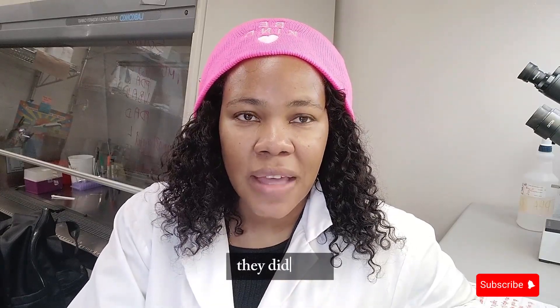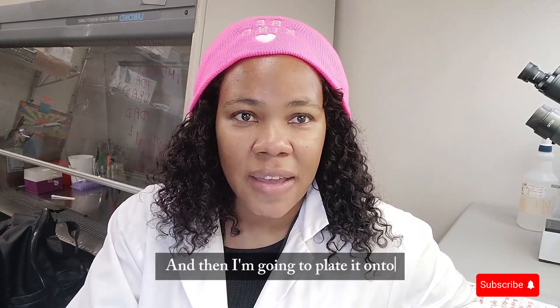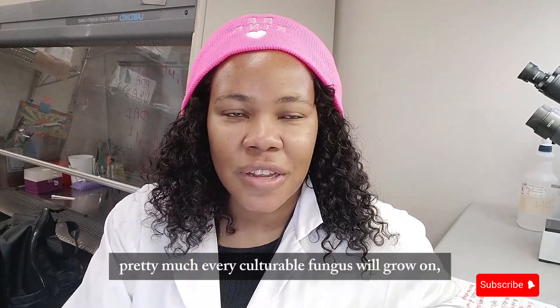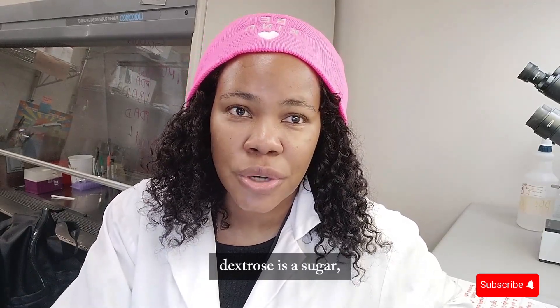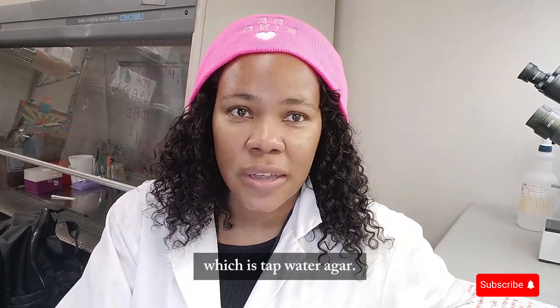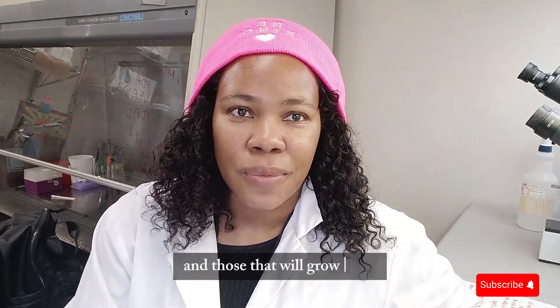Today I'm going to demonstrate a method that is essential for working in a microbiology or plant pathology lab — isolating, maintaining, and working with pure cultures. I'll be isolating a fungal isolate from an environmental sample. I'm going to surface sterilize it using a weak concentration of bleach, then plate it onto two media: potato dextrose agar, which is sugar-rich for fast growers, and tap water agar, which is nutrient-poor for slow growers.